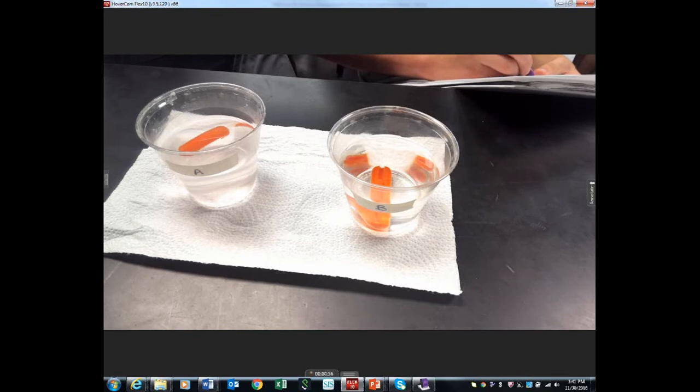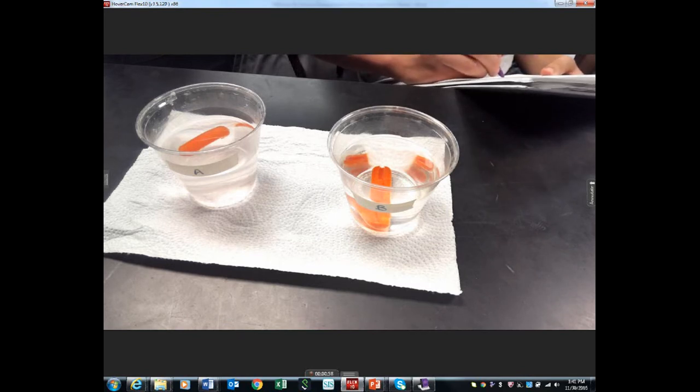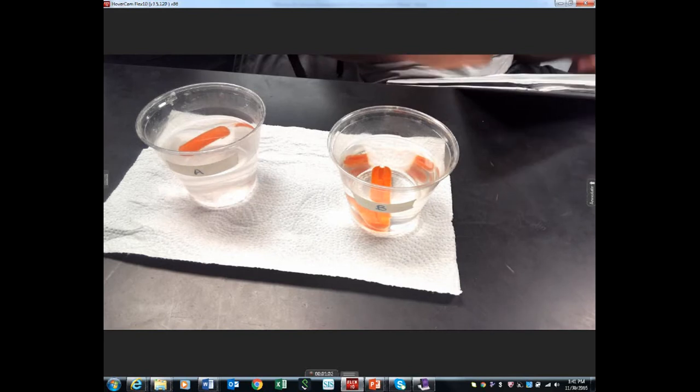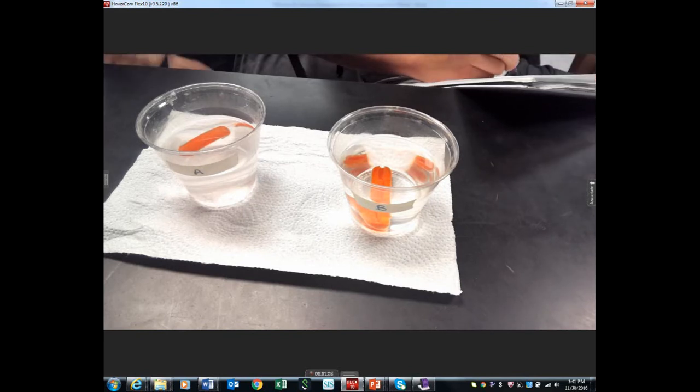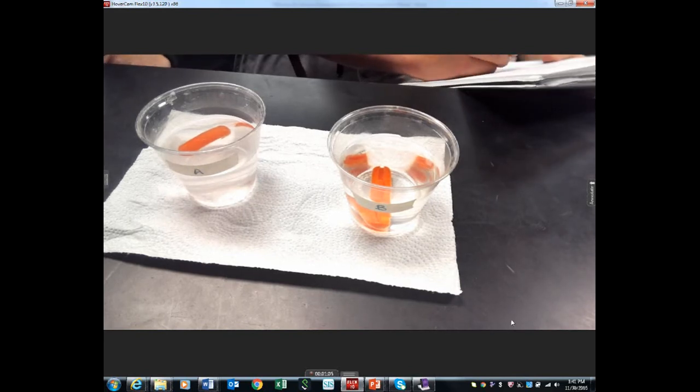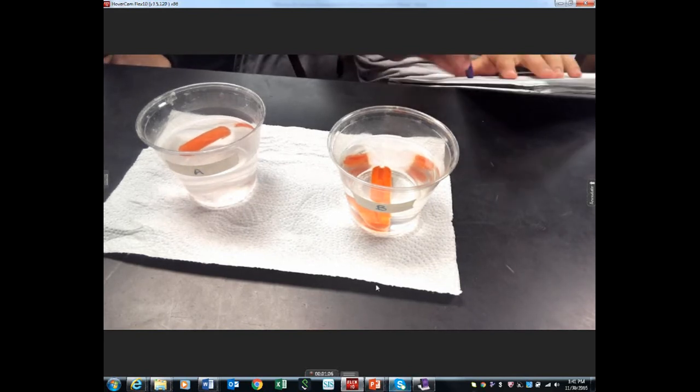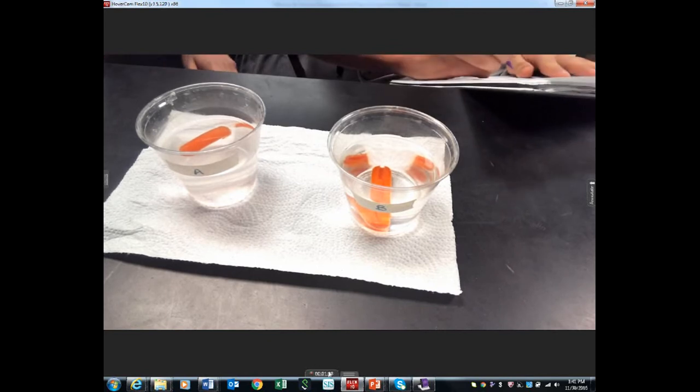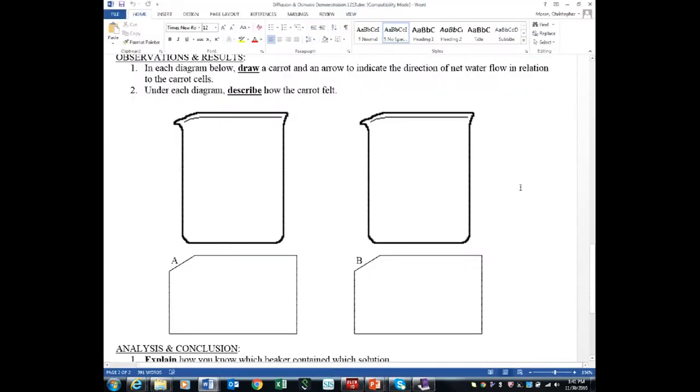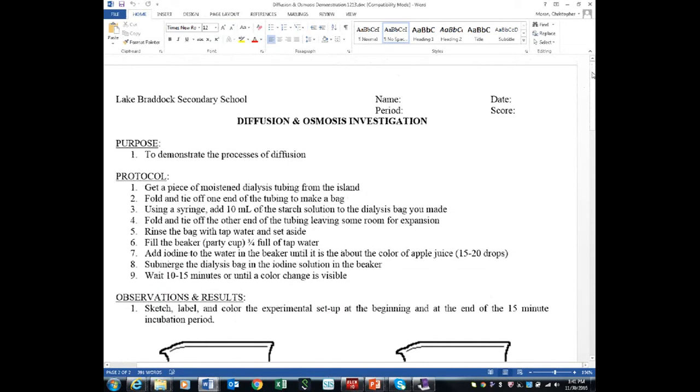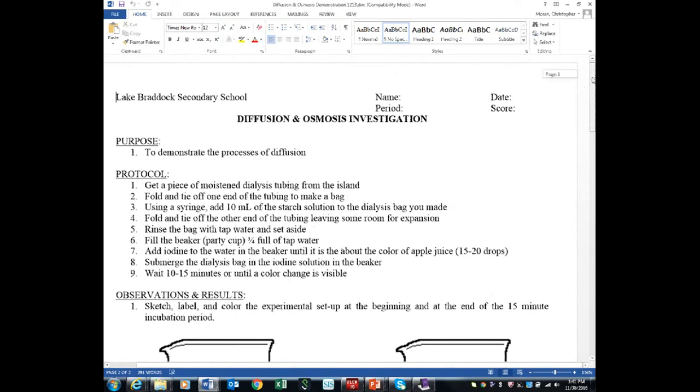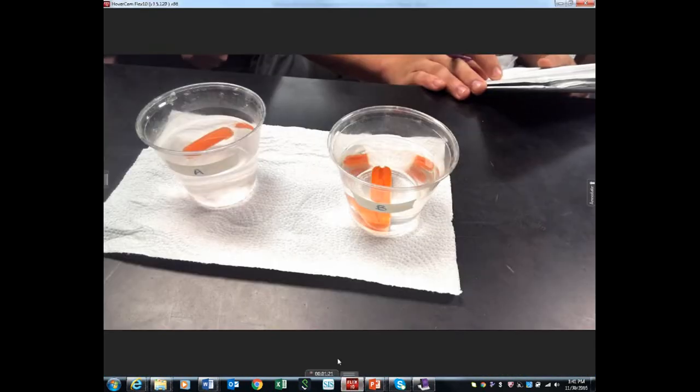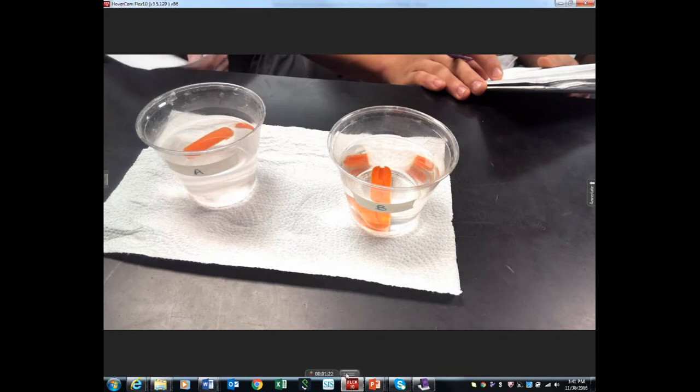You need to explain what's going on there. Solution B, later on we're going to talk and say which one of these is hypertonic and which one is hypotonic. What we're going to do is let this set, then go ahead and do the front of the handout and start setting up the dialysis tubing.